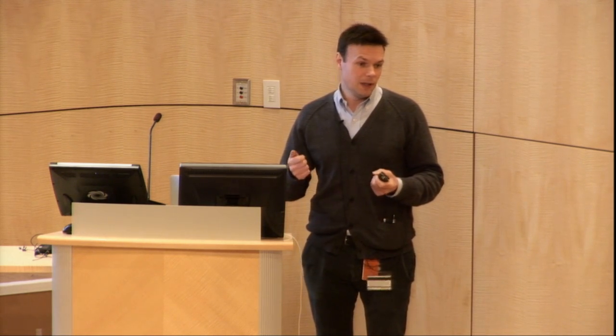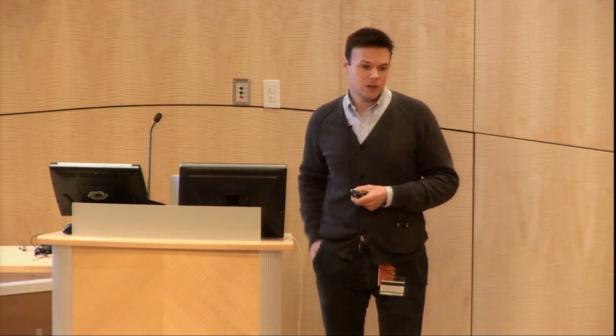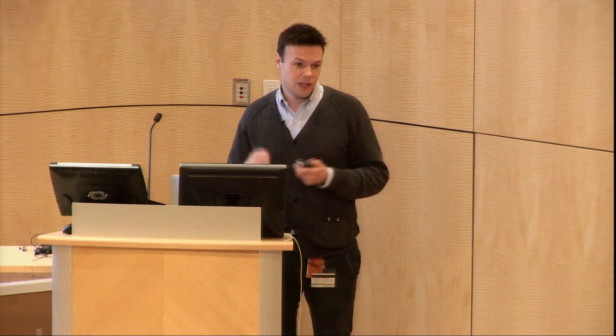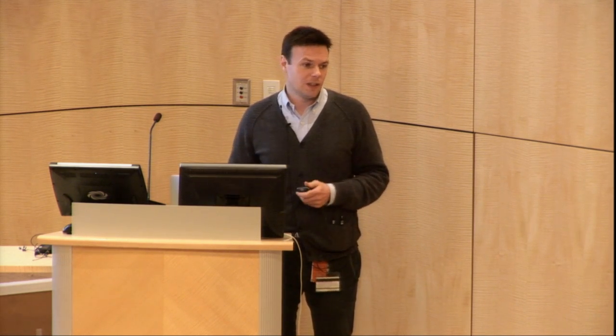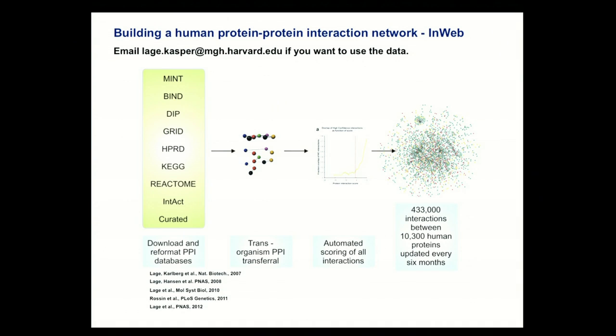So if you find an interesting interaction in InWeb that somehow supports your data or generates a hypothesis in your head, then you could go back and read the source publication, so you could actually be sure that they did the experiment properly and that it isn't an annotation mistake or anything of that sort. And I think those are two key elements of InWeb: the ability to trace back protein interaction data, and that we have a uniform and quantitative protein confidence score in each individual edge.